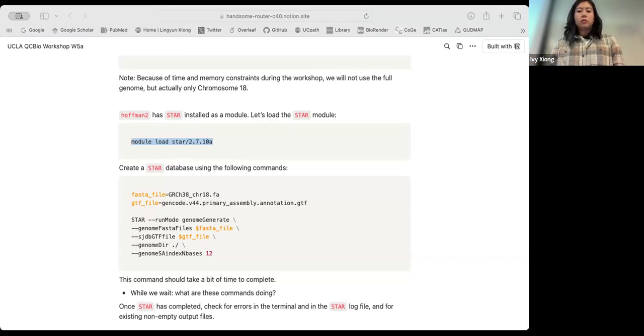Good question. What's the difference between unzip and gunzip? There are two different tools, unzip and gunzip. It depends on the ending of the file. If it's zipped, you unzip it. If it's gzip, you have to gunzip it.